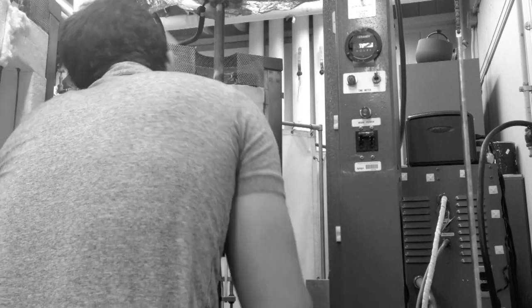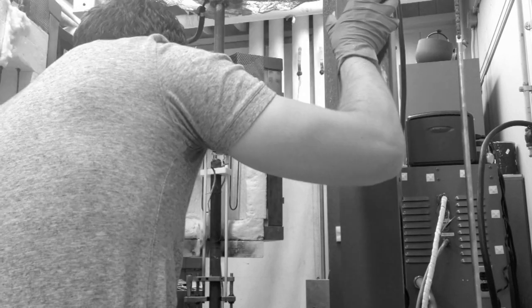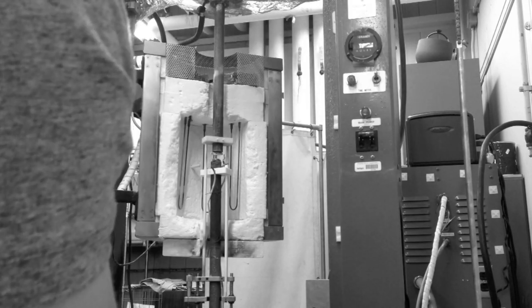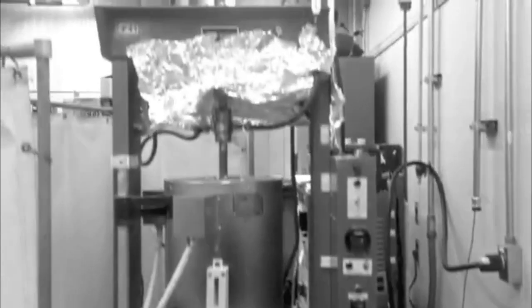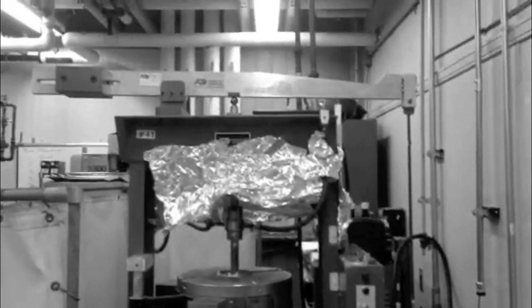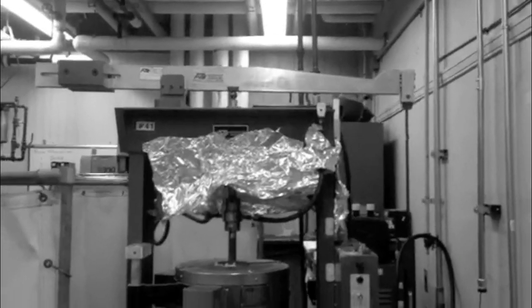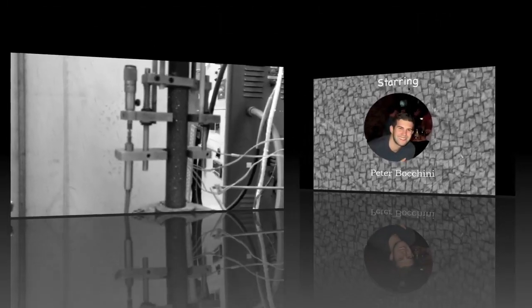Once this setup is complete, weights are placed on the end of a lever arm which then presses against the top compression ram. A displacement sensor measures how much this sample is deformed, and through this we can see how resistant to plastic flow these new alloys are.